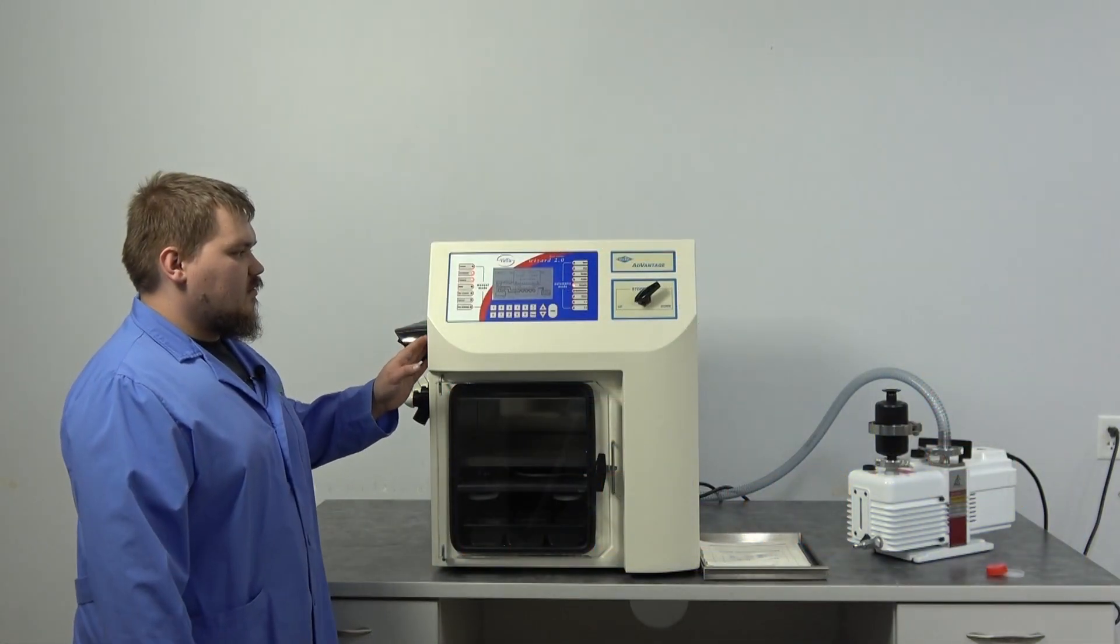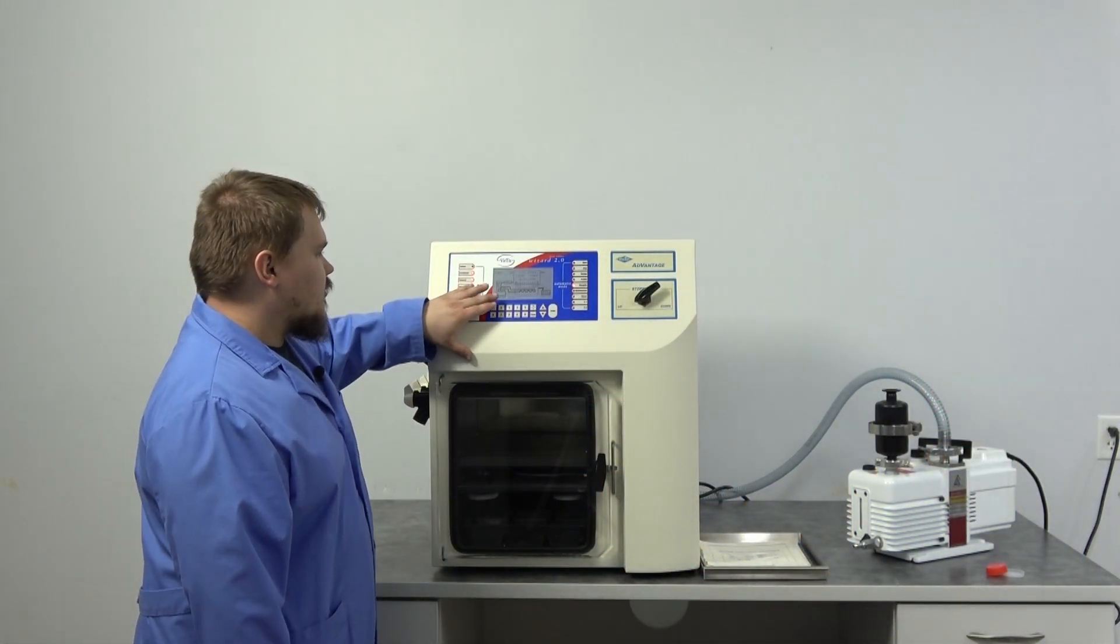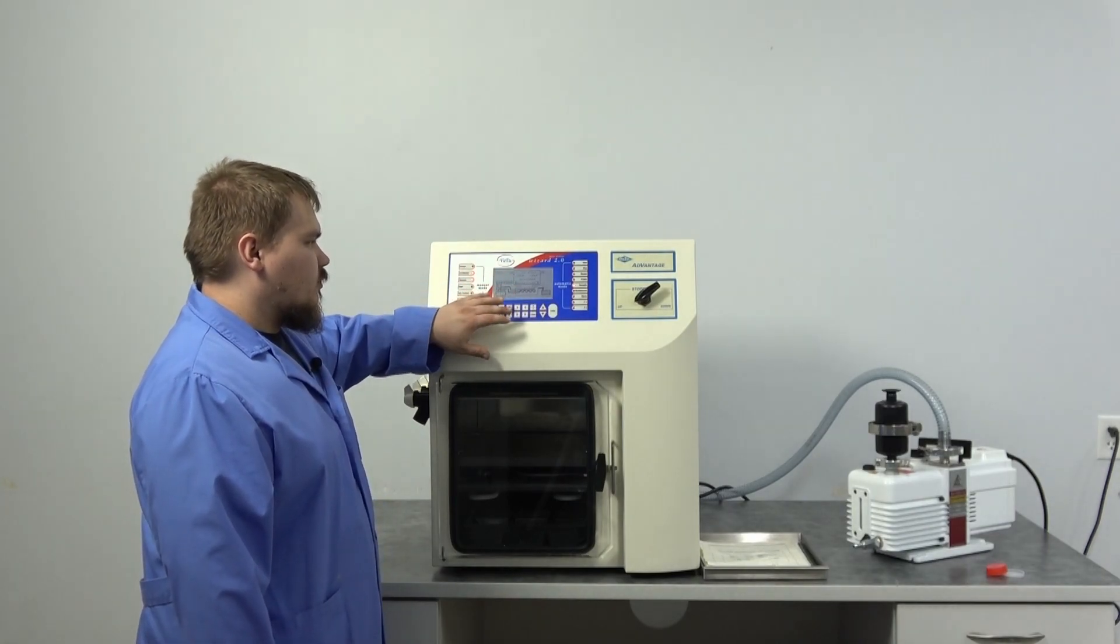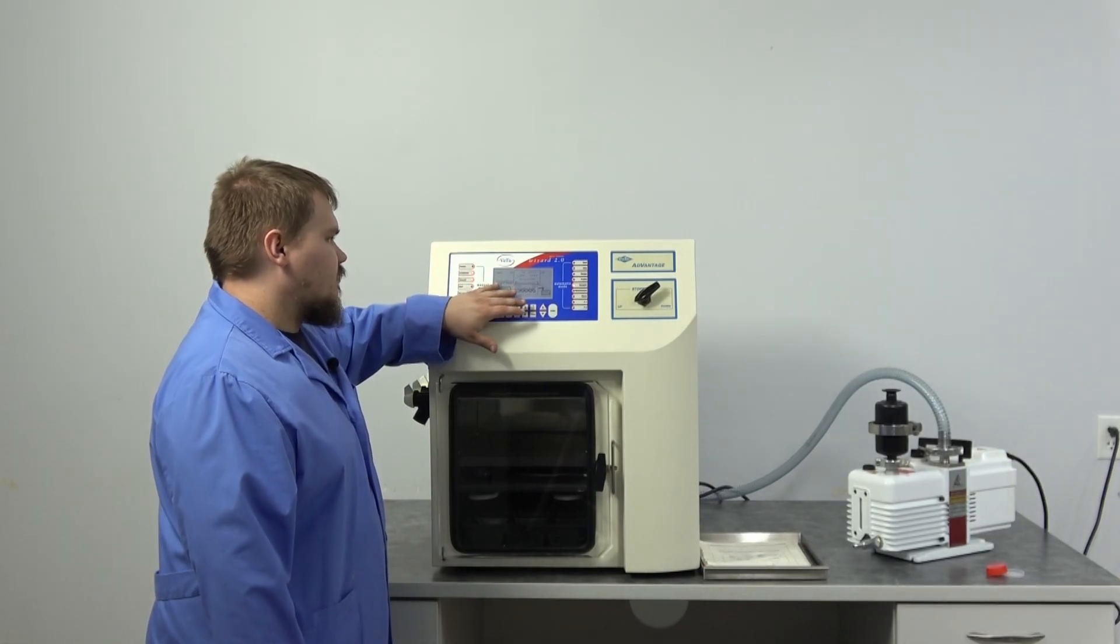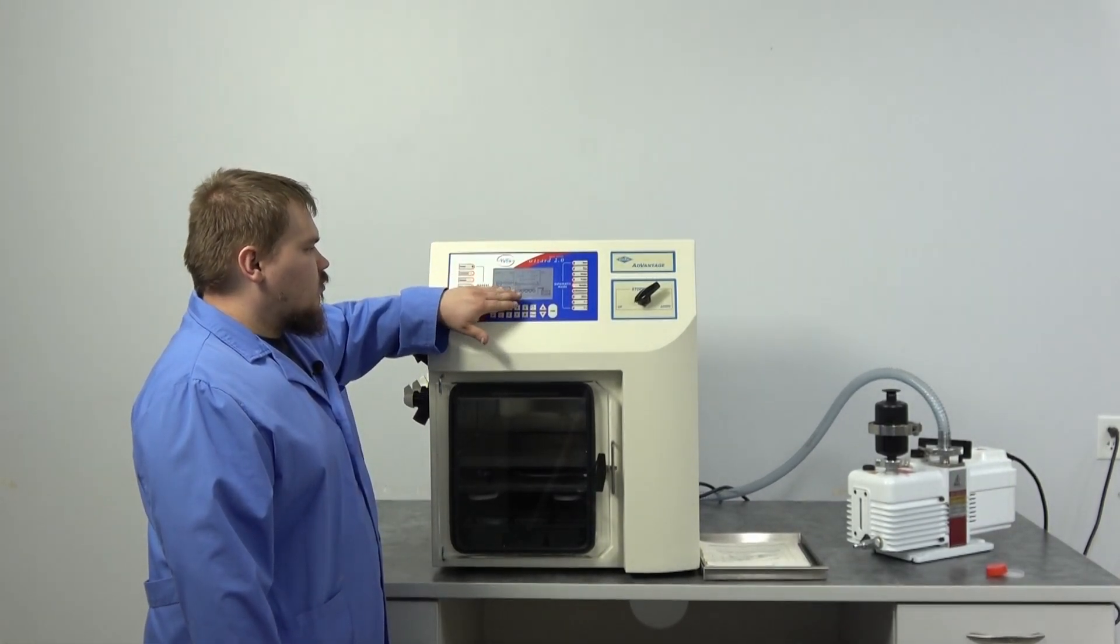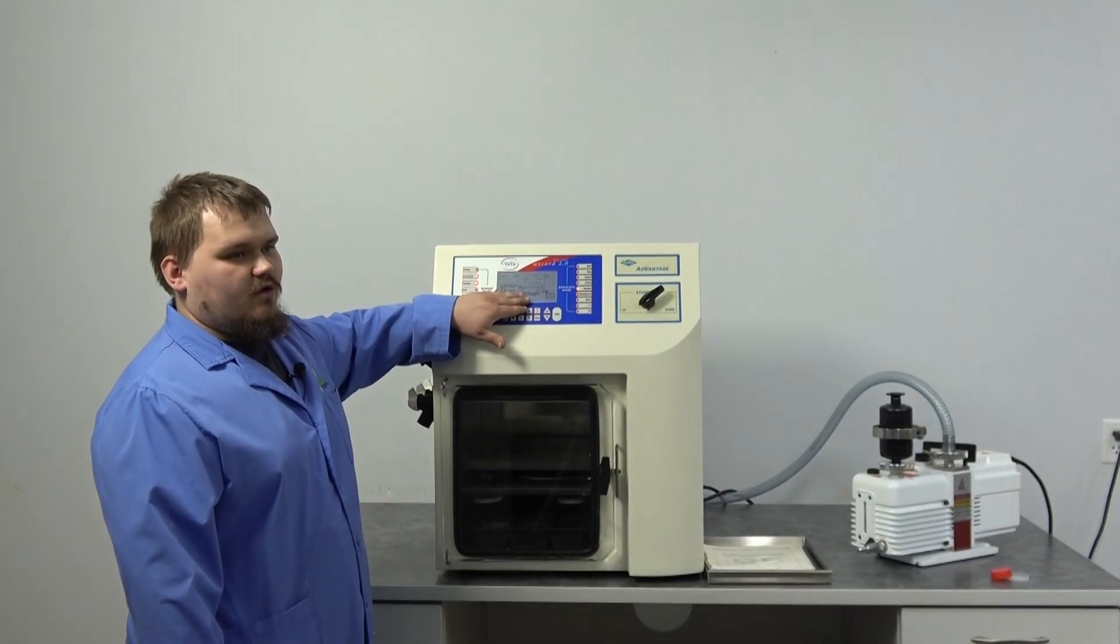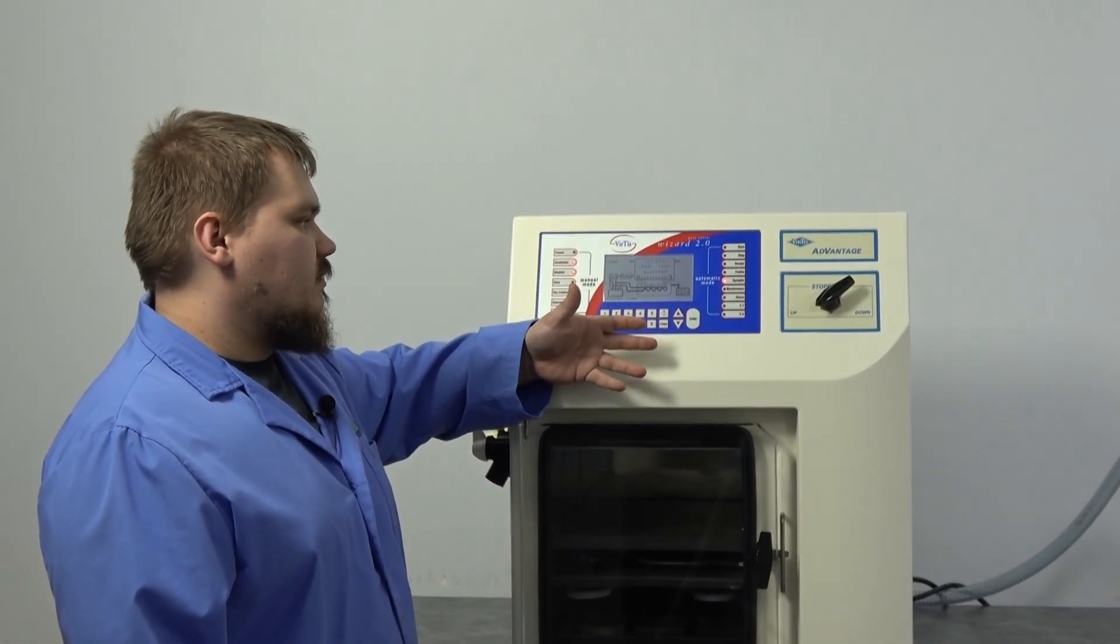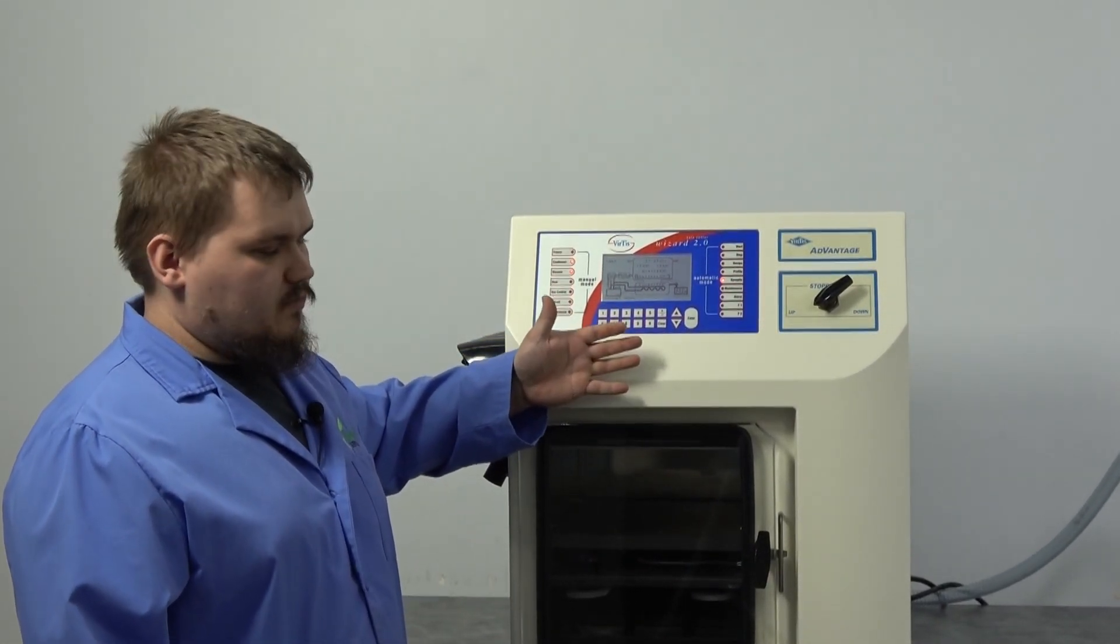All right, now the machine is down to specification for the vacuum. It is right around 17, 17-ish mil torr. It can fluctuate a little bit, especially with lower vacuums. And something else you're going to notice is the temperature also dropped a couple more degrees. Like I said, it's going to drop with vacuum also.